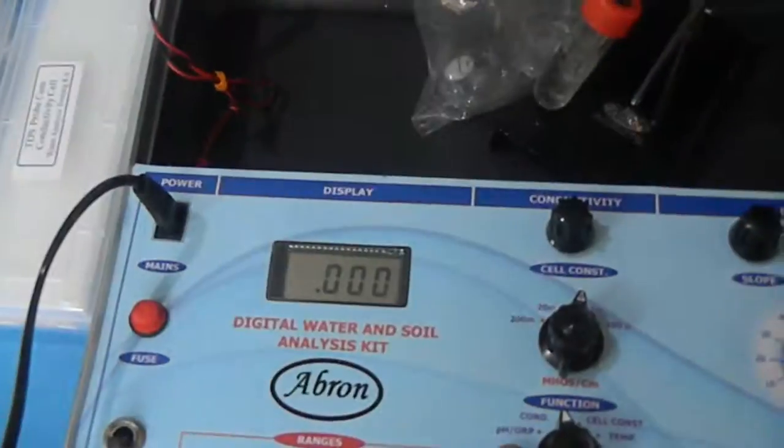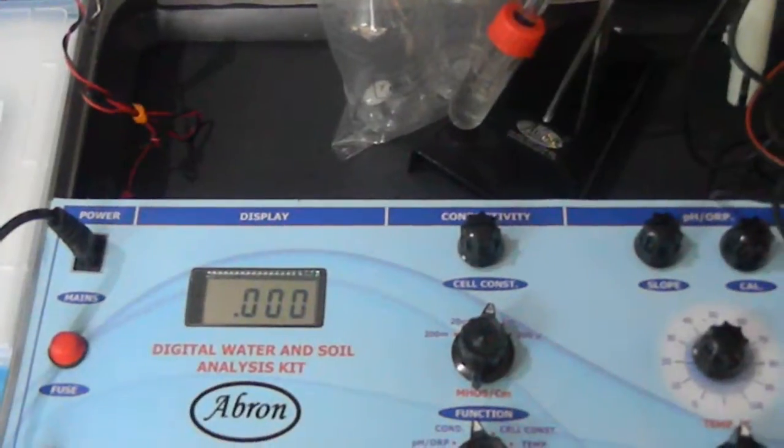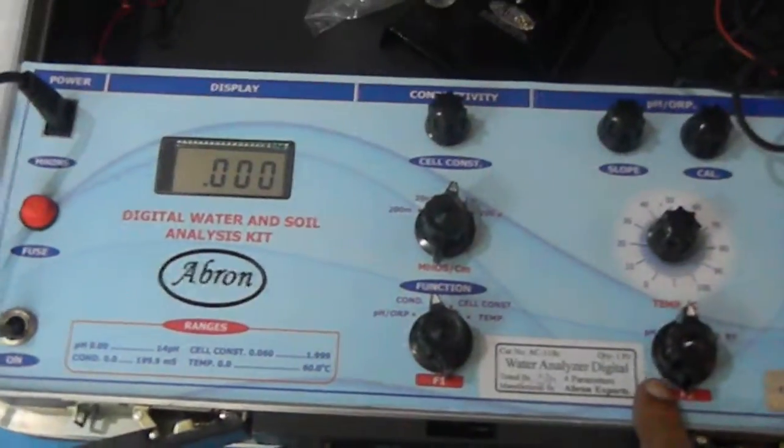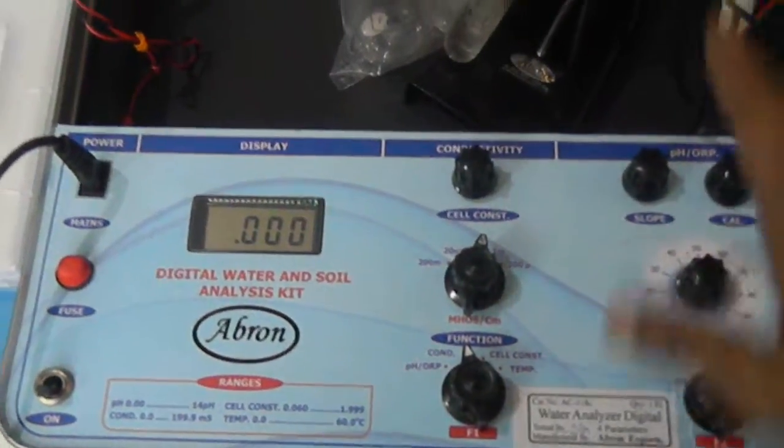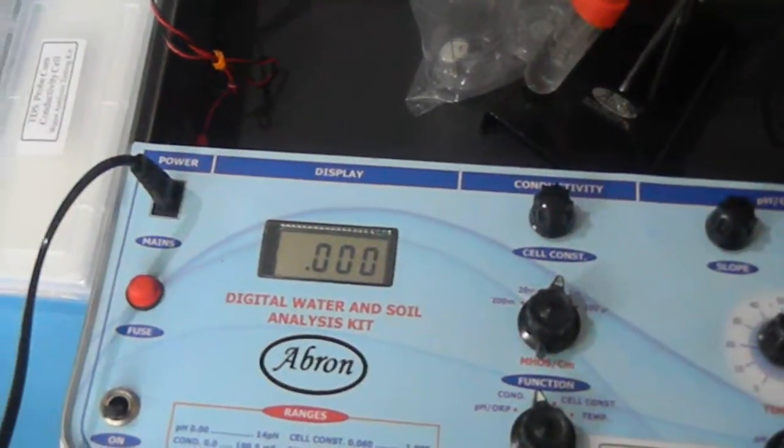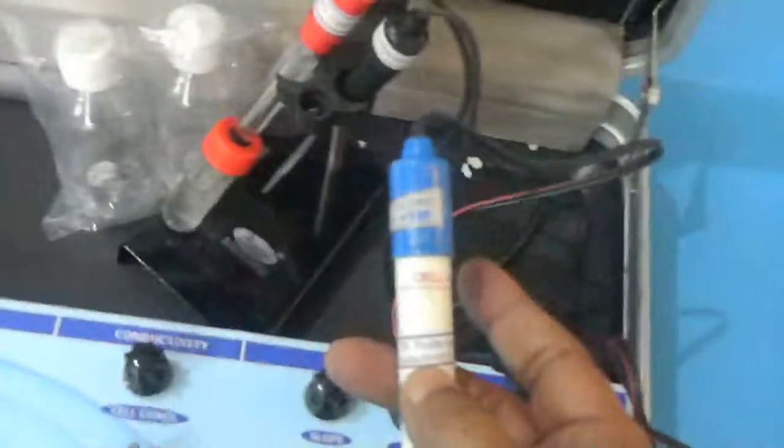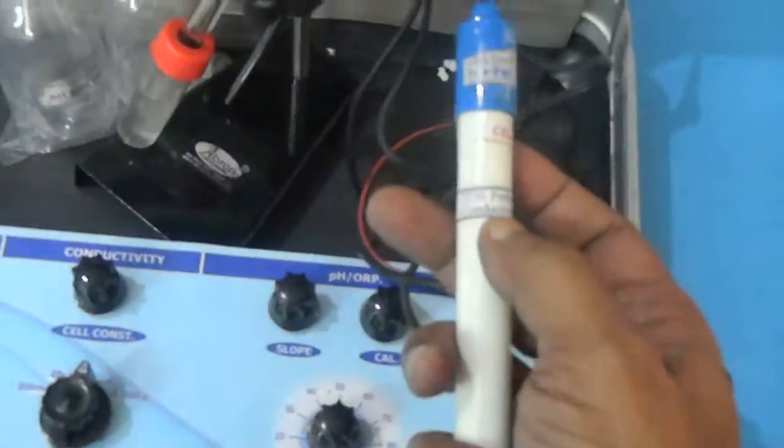This pH and MV probe is the single one. It will give you pH and MV both models in the same probe. And temperature probe is there. Then this conductivity probe is TDS as well as conductivity. This is dual TDS as well as conductivity probe. You can do both these functions from here.